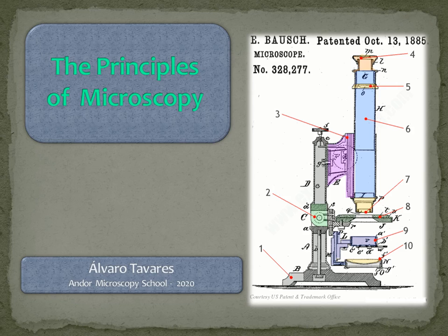Hello everyone, I'm Álvaro Tavares, and in this presentation I will explain some of the details of optics that are at the base of microscopy, and I will try to simultaneously give you some details of the history of microscopy and how microscopes were developed, in this case just visible light microscopy.